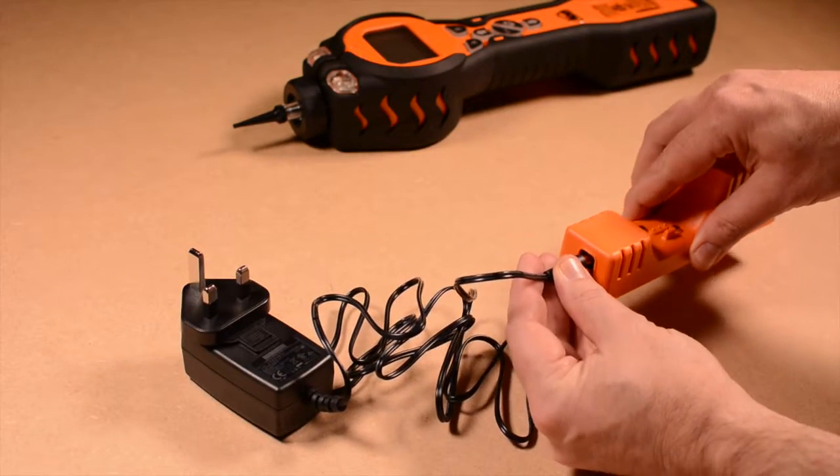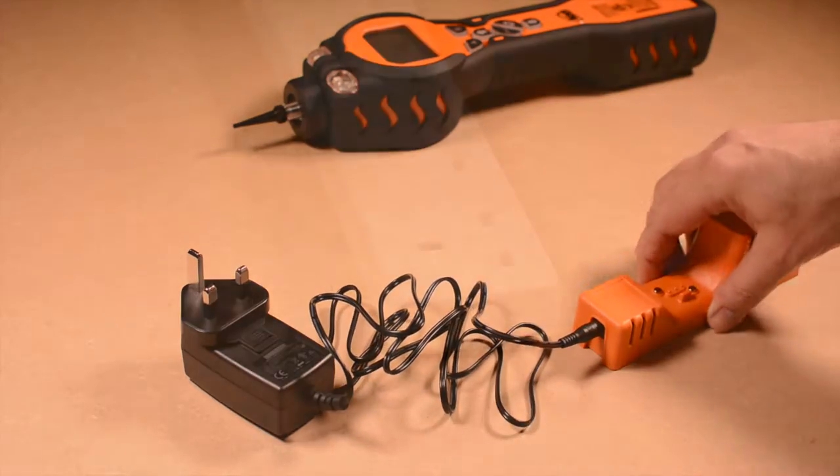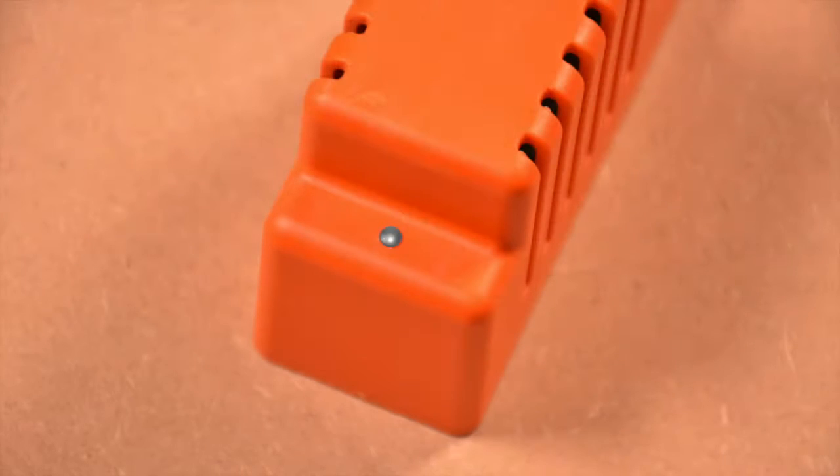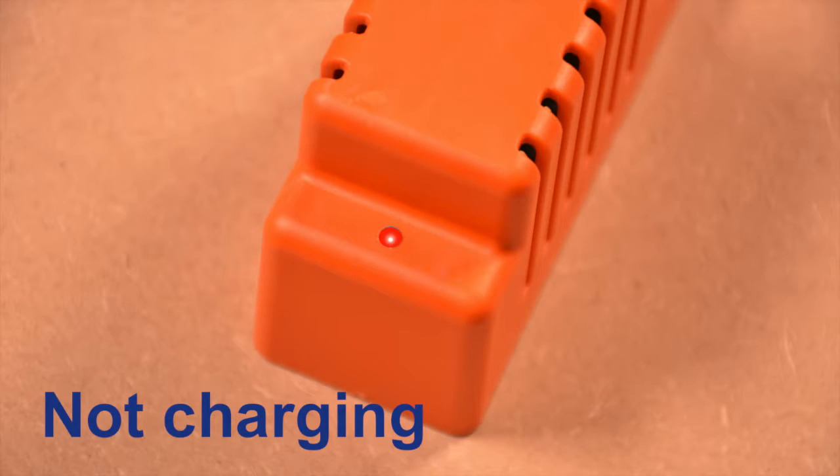Now push the charger jack into the charge cradle socket and plug in the power adapter. The LED initially illuminates red, suggesting power is on but it's not yet charging.